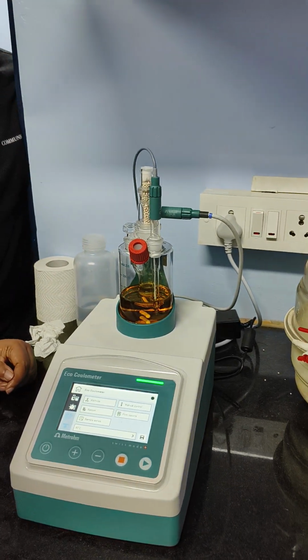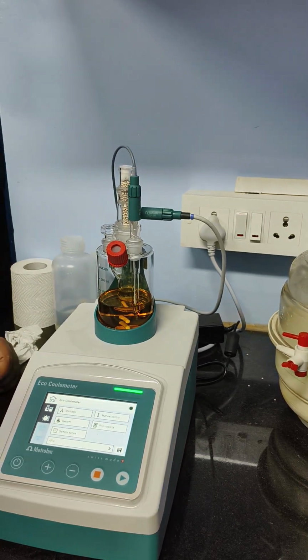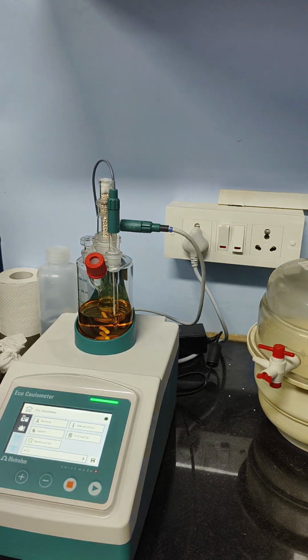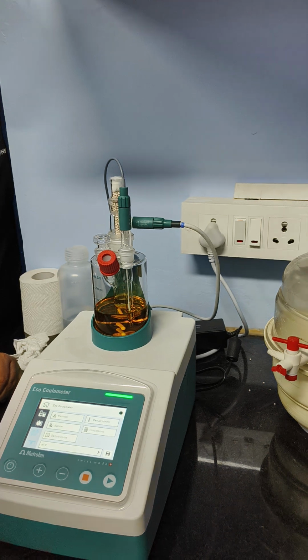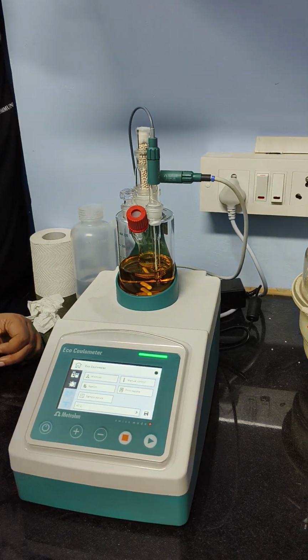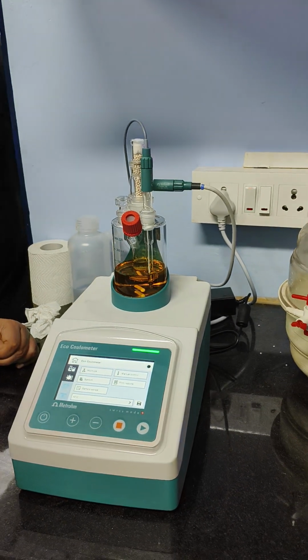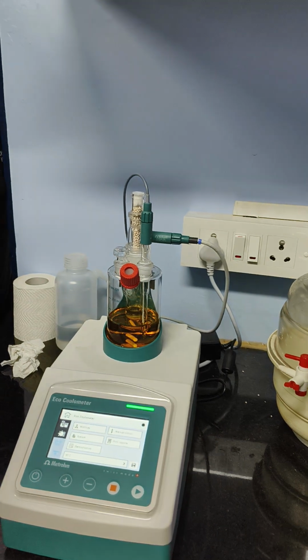So what are those known standards? You can have a 1000 ppm water standard, a 10,000 ppm water standard and a 100 ppm water standard. Those standards you can inject and check. And in coulometry, when the moisture level is low, you have to take a higher volume of your sample. When the moisture is on the higher side, you have to take a lower volume of your sample.